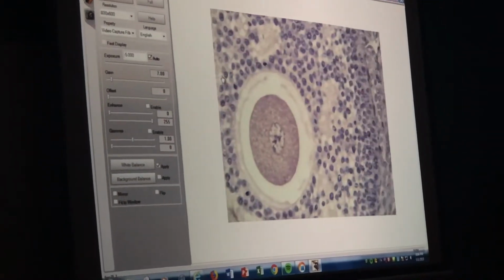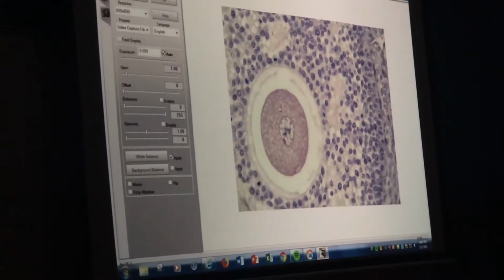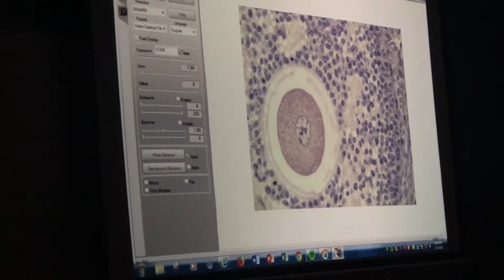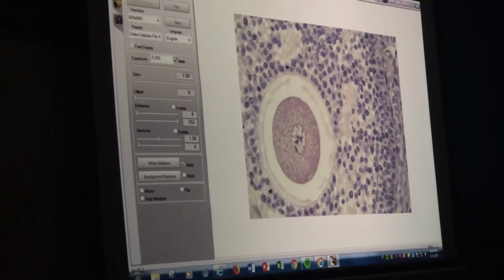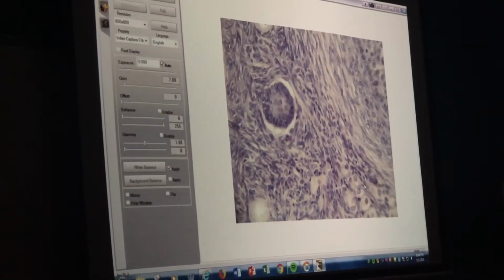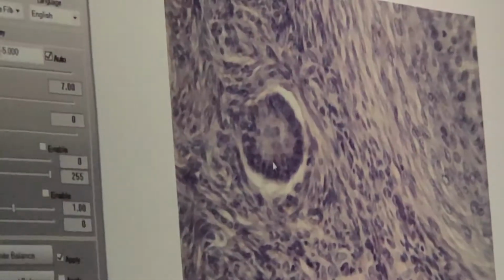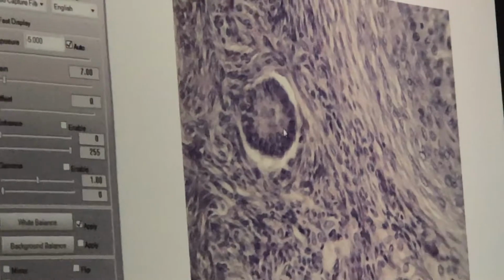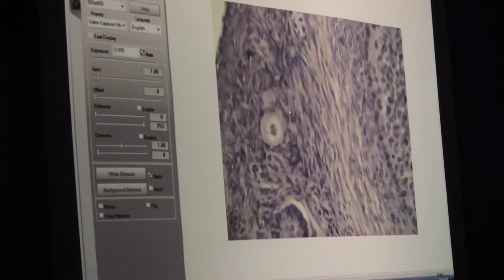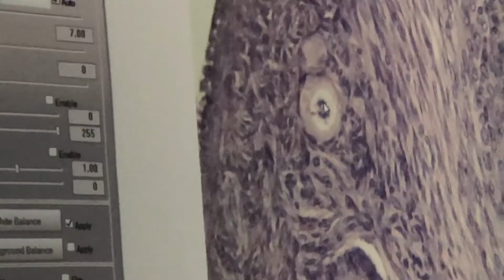There's going to be a mature one again. So again, this one looks more like what Emily and Alex were looking at earlier. So here's the egg. The zona pellucida would be in this area here. And then corona radiata and probably cumulus oophorus. I can't see the whole thing. All right, so here, this is probably a primary follicle, but this is one I clipped just the edge of. So what I'm seeing is all granulosa cells. I don't see any ovum over it. Okay. There's a really nice primary one all by itself. See where the arrow is?